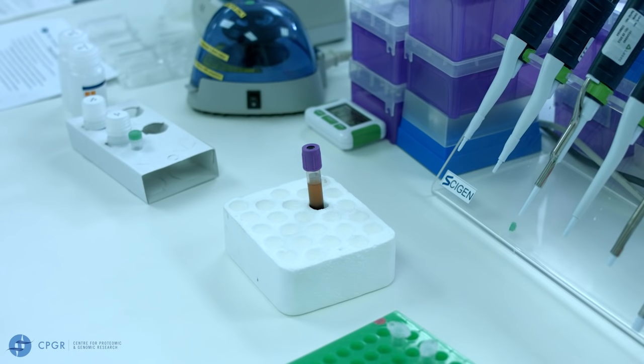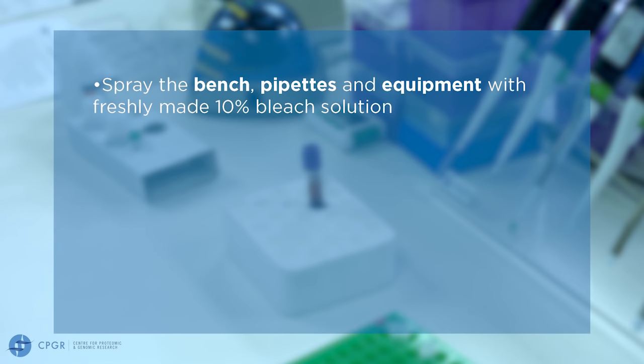Before starting your DNA extraction, ensure that the area where this is being carried out is clean and has been decontaminated. This can be done by spraying the bench, pipettes and equipment to be used with freshly made 10% bleach solution.